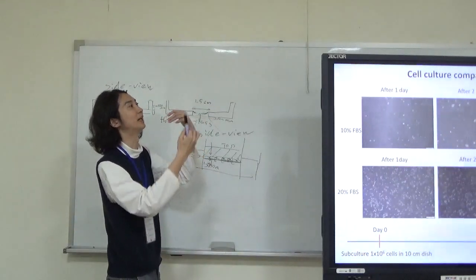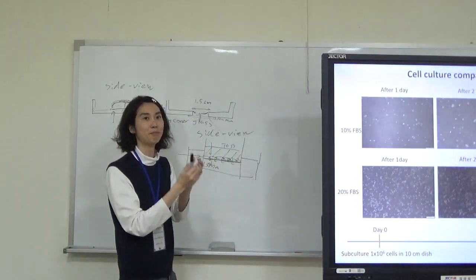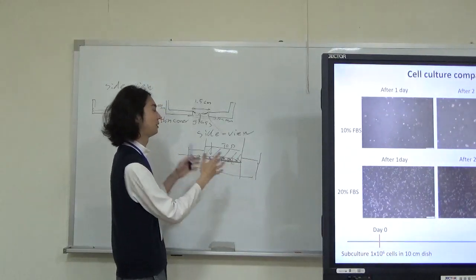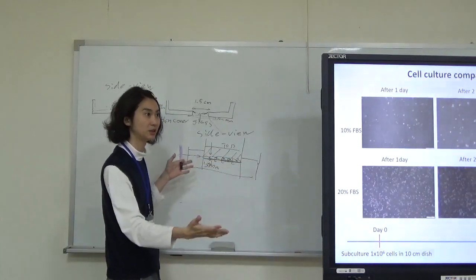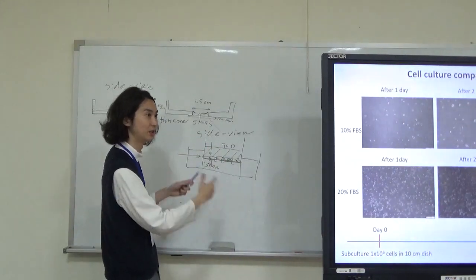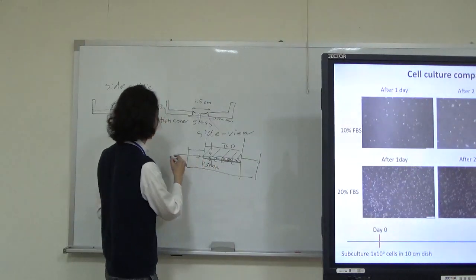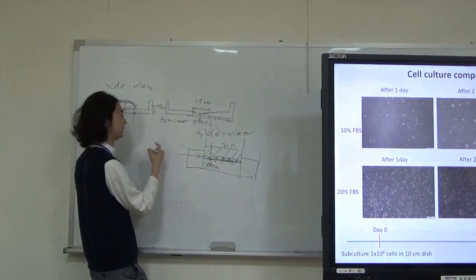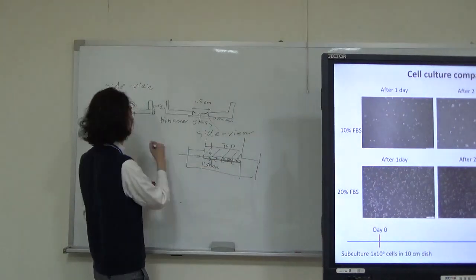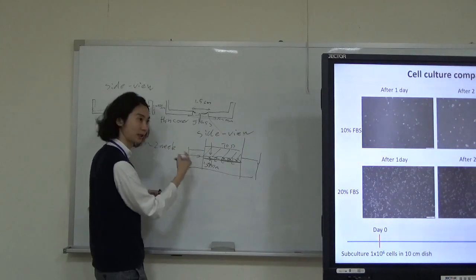Incorporating cells take materials into the cells and pass them to the bottom side. So we don't need the proliferating cells, but cells differentiated into intestinal cells. Many researchers think they need to completely differentiate the Caco2 cells, 1 or 2 weeks after confluence.